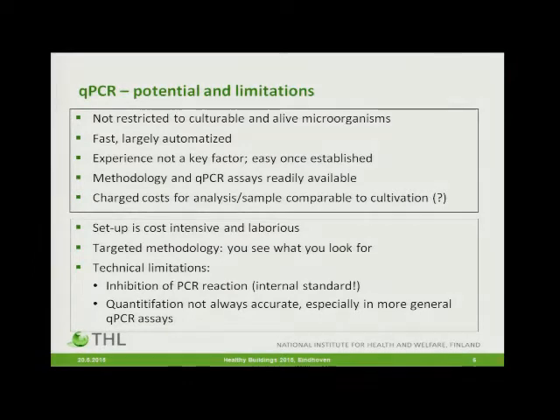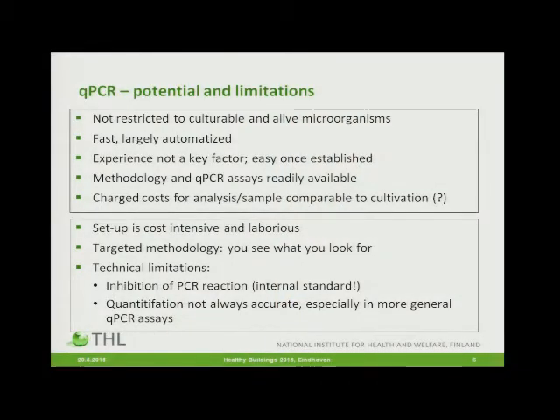So in terms of limitations, setting up the whole thing really takes, you need to pass a certain threshold. It's cost intensive, not only because of the machine, but you need different rooms where you do your sample processing and DNA extraction, and then also the PCR. You're not going to mix this up, so you need space. And it's laborious to get everything up and running. Once it's running, it's straightforward.